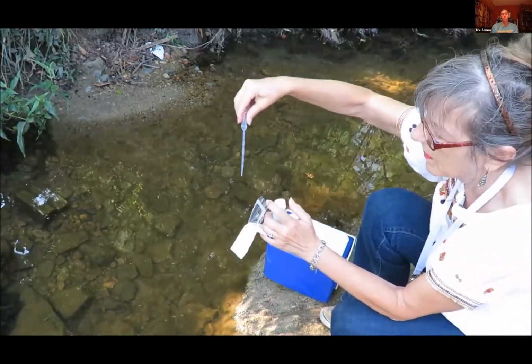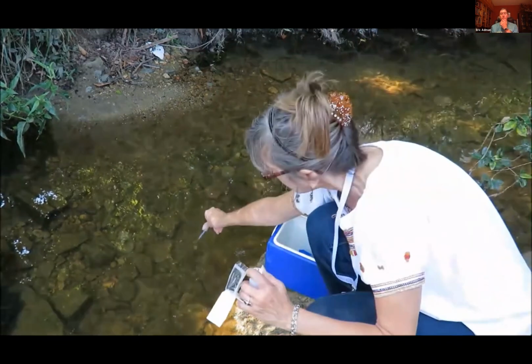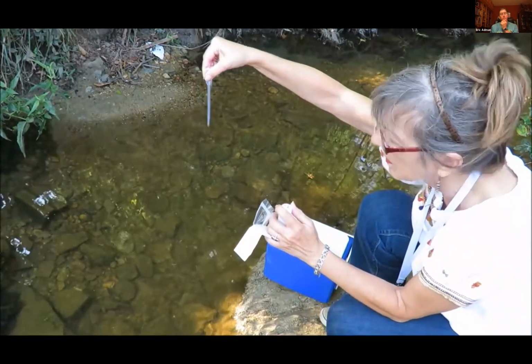Keep in mind that media must be plated within 3 hours of collecting the sample and should remain on ice and out of direct sunlight at all times.